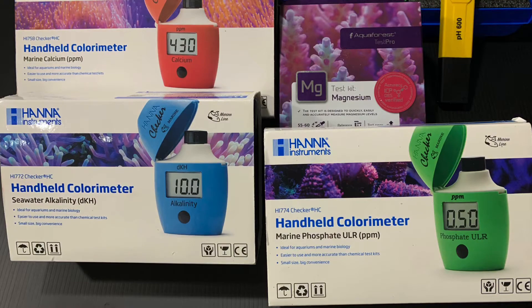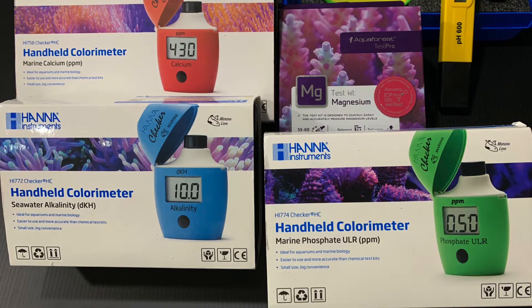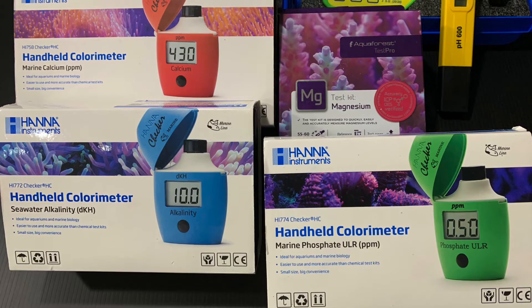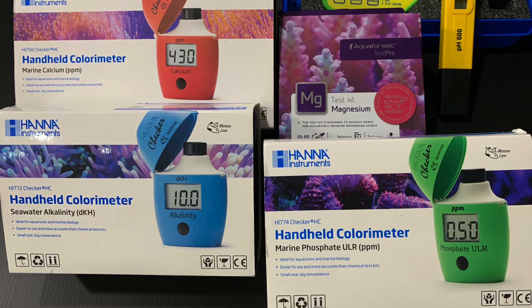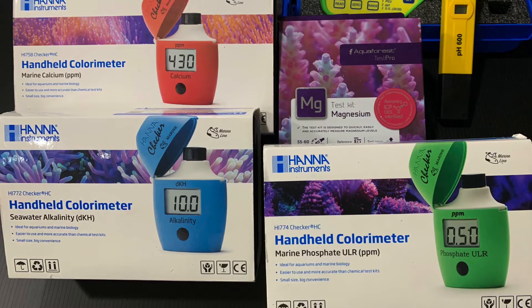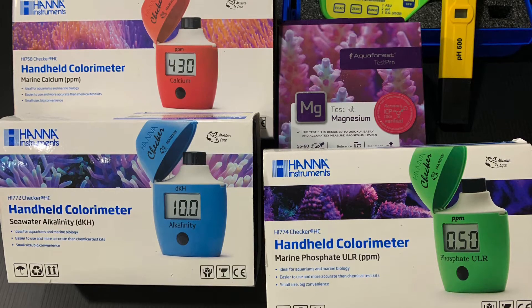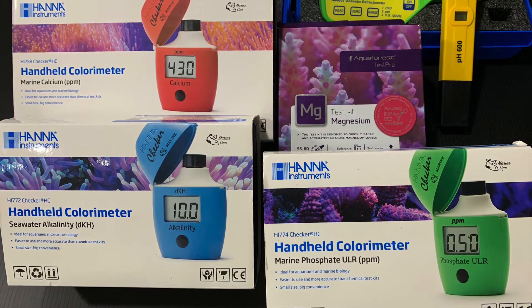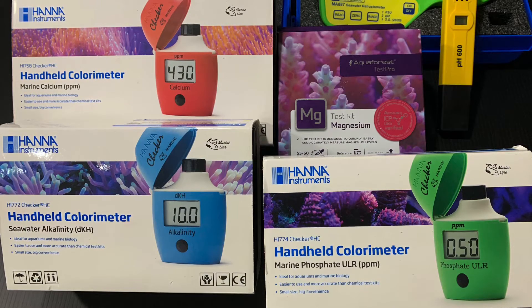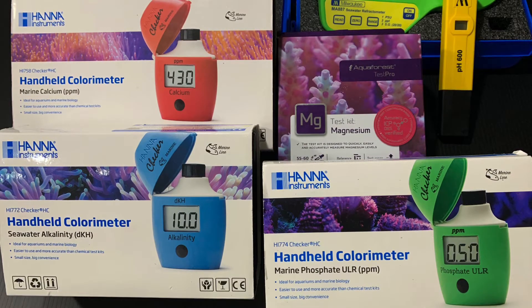Here's a quick snapshot of all the products I use to get my specific parameters. First and foremost, I am a huge fan of Hanna Instruments and their product line — they have definitely changed the game on making it easier for hobbyists to dial in their numbers and putting the fun back into the hobby. I have the calcium Hanna checker, the dKH/alkalinity checker, and also the phosphate checker. Unfortunately, they don't yet have a magnesium Hanna checker — I've been waiting since 2014. They dropped a copper checker, which I'm going to get, but no magnesium one yet.